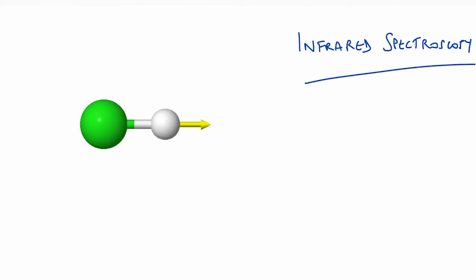Today we are talking infrared spectroscopy. I'm going to show you how vibrating bonds in a molecule can tell us all about the functional groups present. This is a really powerful analytical tool. So, infrared spectroscopy is a type of vibrational spectroscopy. We're talking about the motion of atoms in individual chemical bonds.